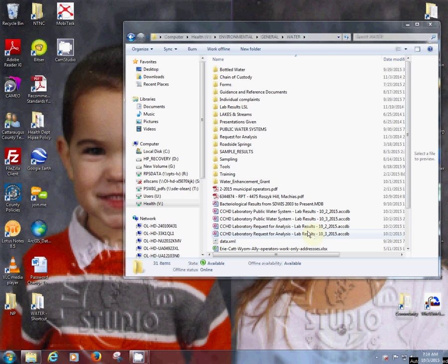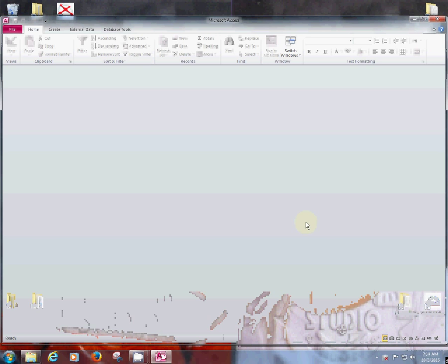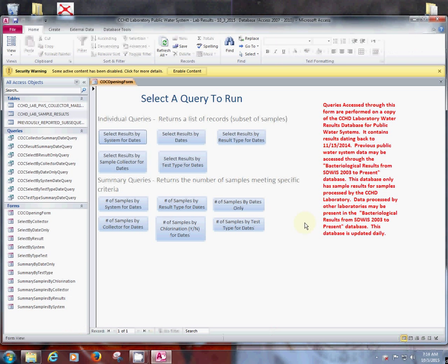Let's open up the public water system one. Those are created every night, and they are a copy of the master database. Alright, remember we have to enable content.